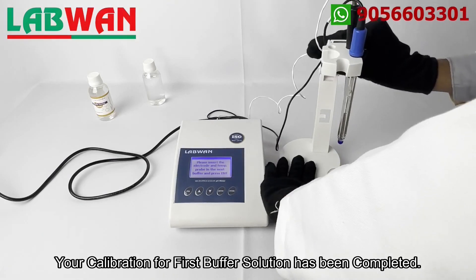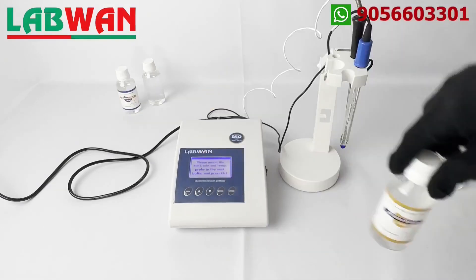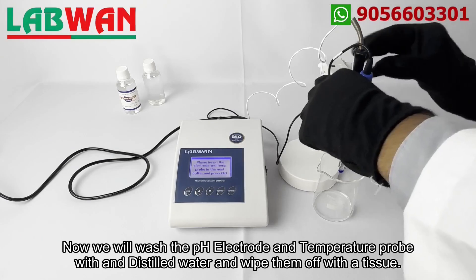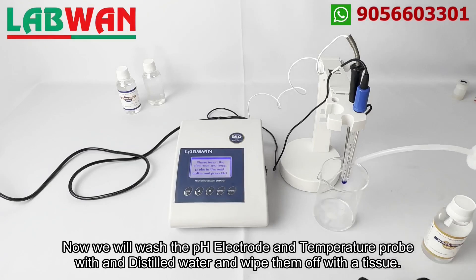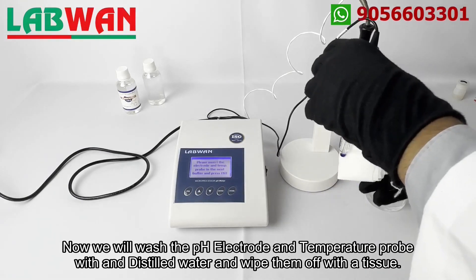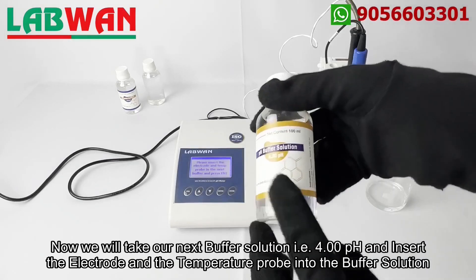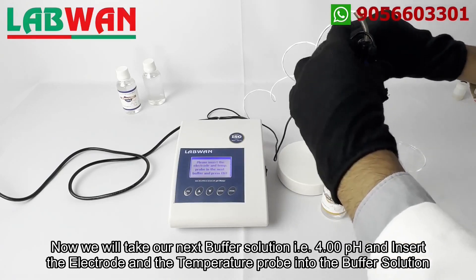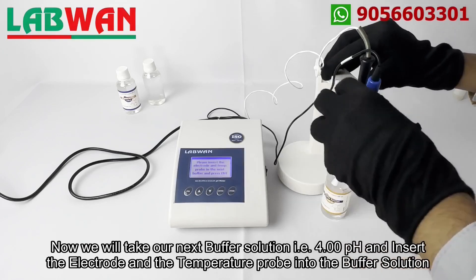Your calibration for the first buffer solution has been completed. Now we will wash the pH electrode and temperature probe with distilled water and wipe them off with a tissue. Now we will take our next buffer solution, that is 4.00 pH, and insert the electrode and temperature probe into the buffer solution.